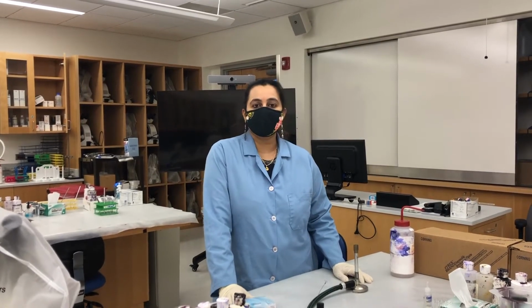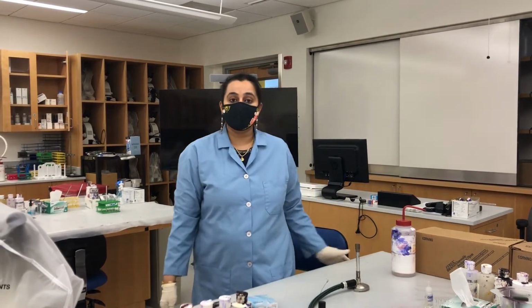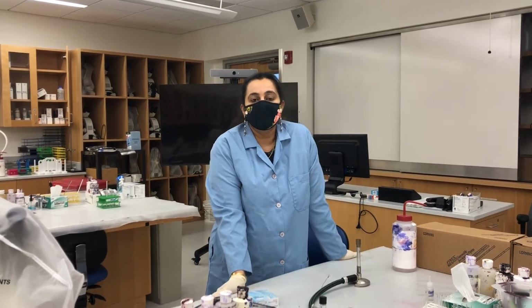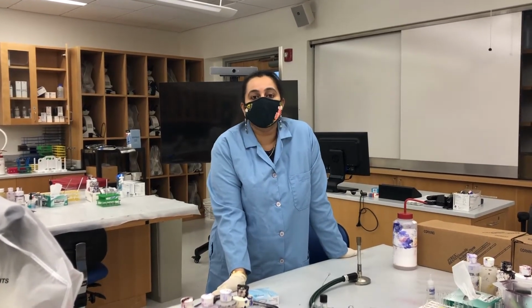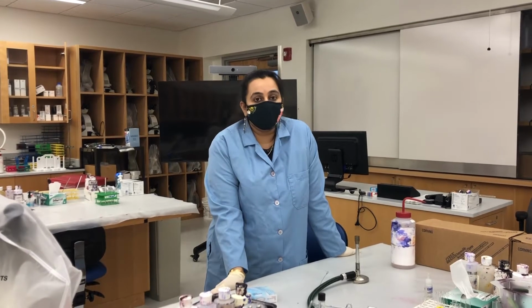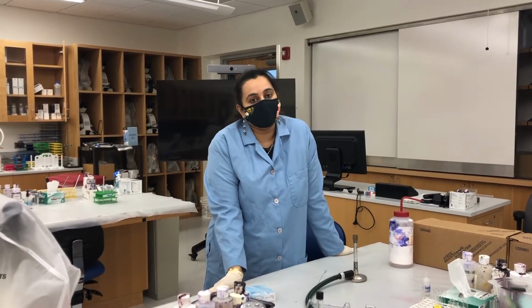As I always said, there are multiple staining techniques in microbiology diagnostic labs. The very first technique that anybody can use is a simple staining technique. Simple staining is you just use one basic stain to quickly take a look at the shape and size of the cells. But that will not give you much information. So that is the reason we need to go for differential staining technique.